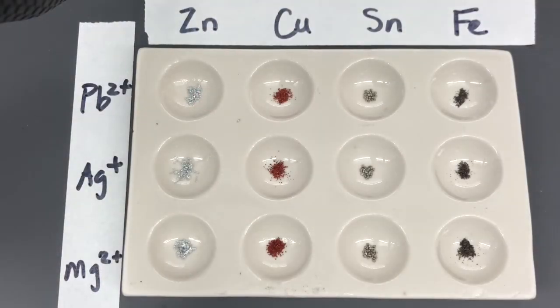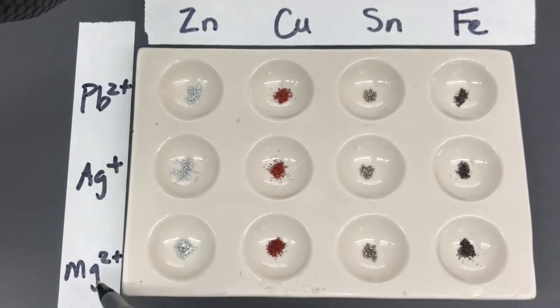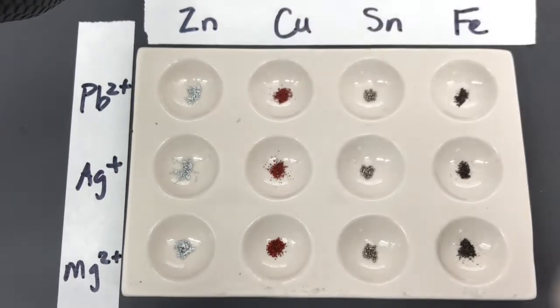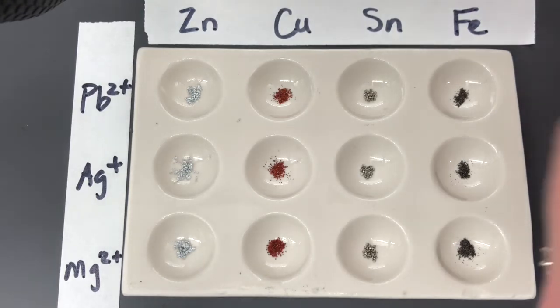For the next set of reactions, we're going to be adding lead 2 plus, silver 1 plus, or magnesium 2 plus to the 4 different metals. This time around, there's no duplicates of metal with metal cation, so we'll have all of the wells open with data to record. So I'm going to start out with some lead 2 nitrate, and I'm going to add it to each of the metals.